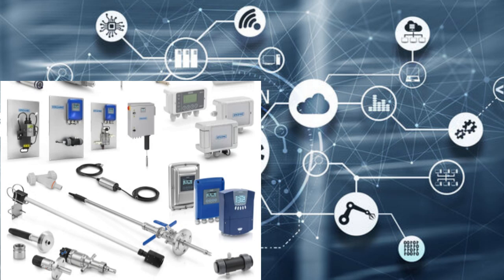Absolutely. Interference is a big deal in turbidity measurement. The manuals talk a lot about understanding what could cause interference. Like even something simple like air bubbles dissolved in the water can scatter light and make it look more turbid than it really is. That's crazy. So it's not just the particles themselves, it's about everything that's going on in the water sample. Exactly. It's a whole bunch of factors interacting with each other.